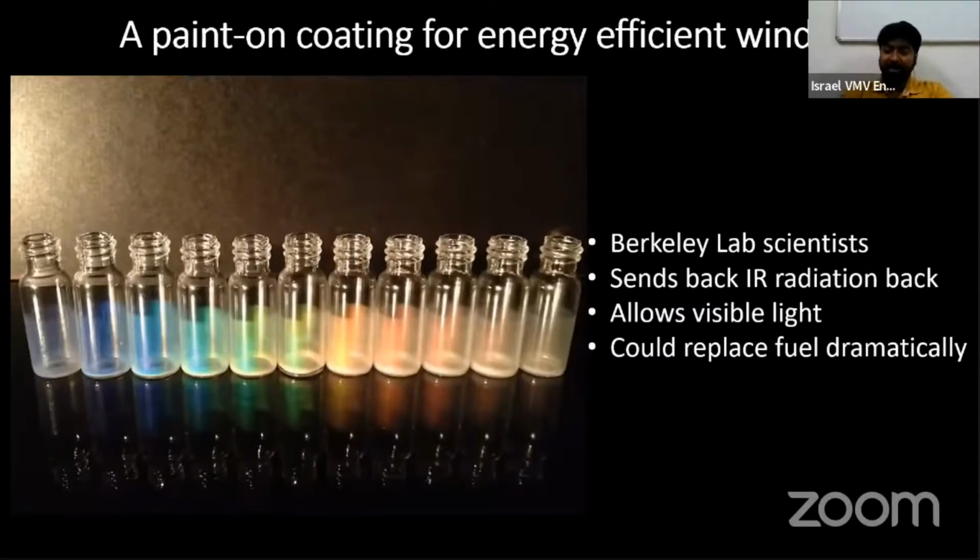All depends on how light is absorbed. To study how light is absorbed, what kind of wavelength is absorbed and emitted, you should start from UV visible spectroscopy. I talked about the microscopy: scanning tunneling microscopy, atomic force microscopy, transmission electron microscopy. But you can start from ultraviolet visible spectroscopy. The UV visible spectrometer costs just around 4 lakhs. And it's not like other nanotechnology tools, which are costly as far as the analysis and the research are concerned.